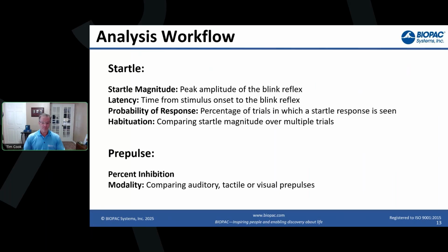So if they're coming into your lab and sitting down, they're generally running a trial which is going to run approximately 20 minutes or so if you're getting 30 trials, with the spacing of somewhere between 15 to 30 seconds between each presentation of the pre-pulse and the pulse. So generally a recording session for each subject is going to run between 15 and 20 minutes.